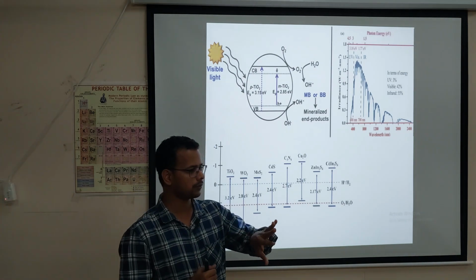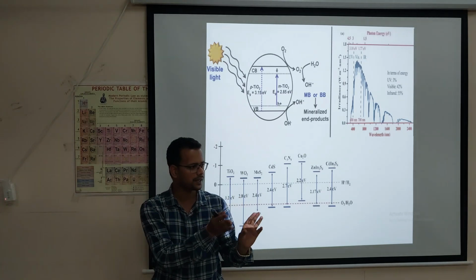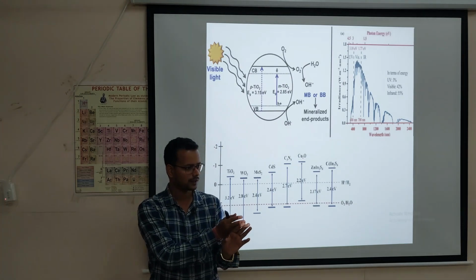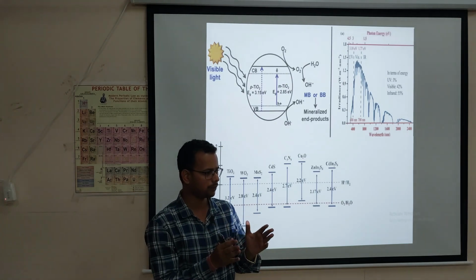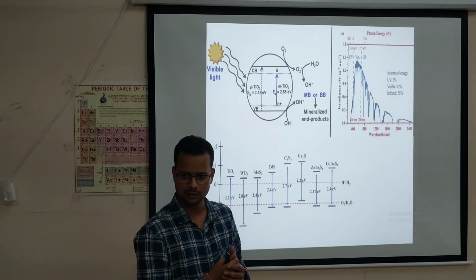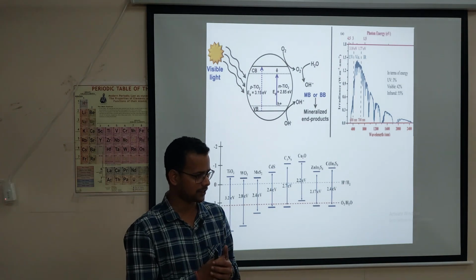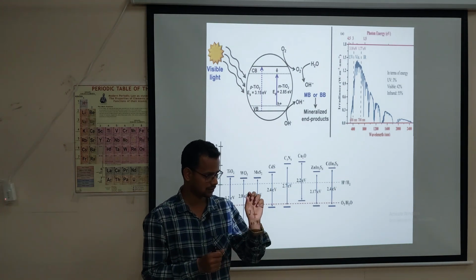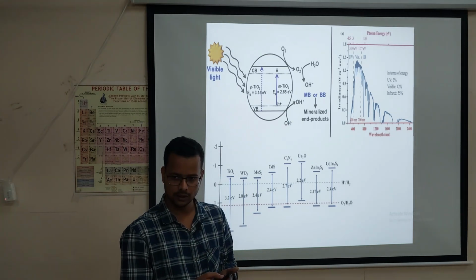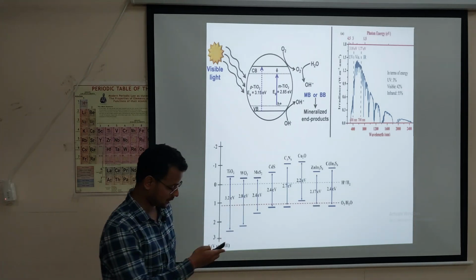In some of the materials that we have developed, we get a very small band gap. We have maybe one or two materials in the lab which are IR active, though not 100%. Clear? Can you move to the next one?